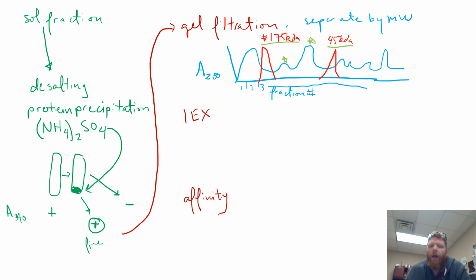Okay. Ion exchange chromatography falls into 2 different categories. There's cation exchange chromatography and anion exchange chromatography. Now, what this relates to is what is immobilized permanently on the column. So think about this as ion exchange chromatography is, well, it is a column, and there are small beads. And each one of these beads has a very small modification onto them. So let's draw this right here.